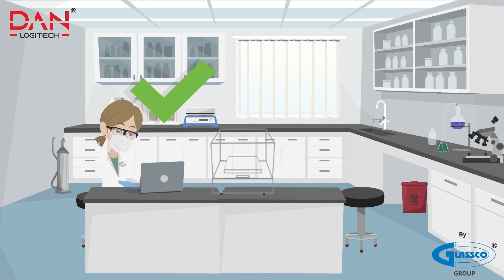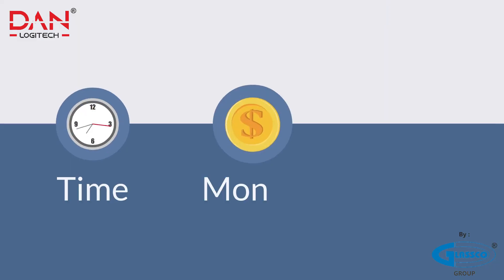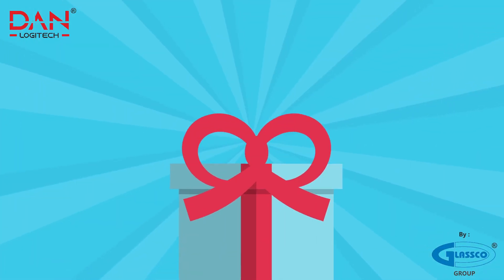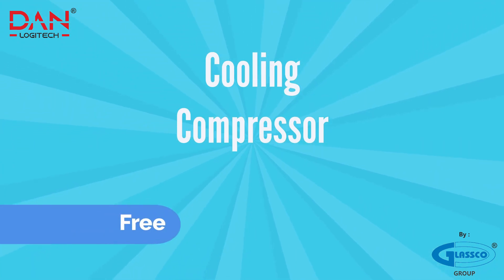You need only one operator to operate this incubator shaker. It not only saves your time, but money and space too. On each purchase of Dan Logitech's incubator shaker, you get the cooling compressor for free.